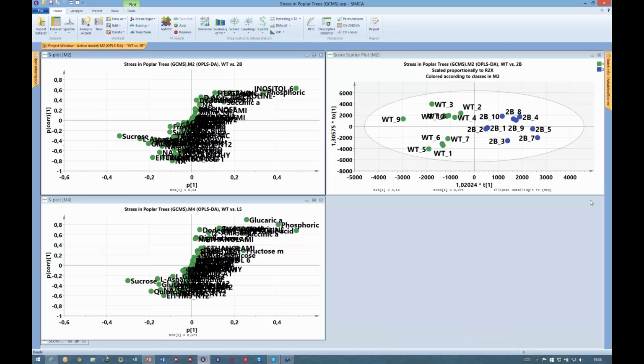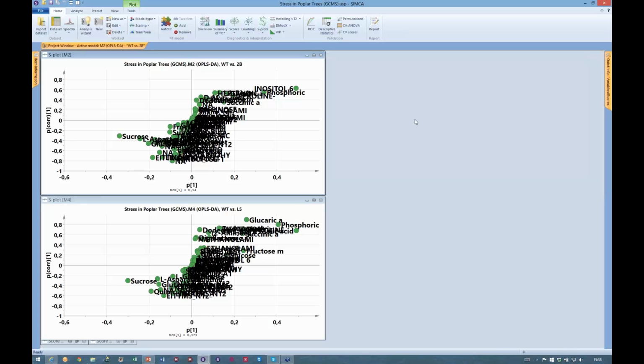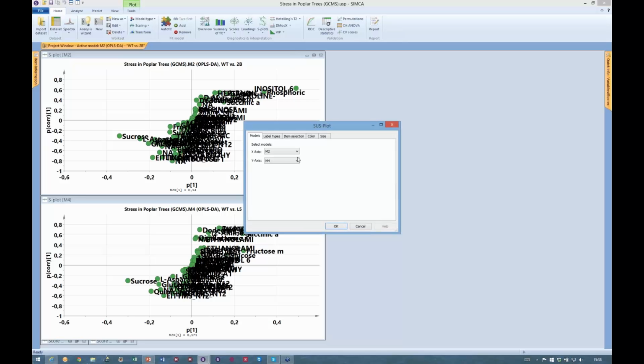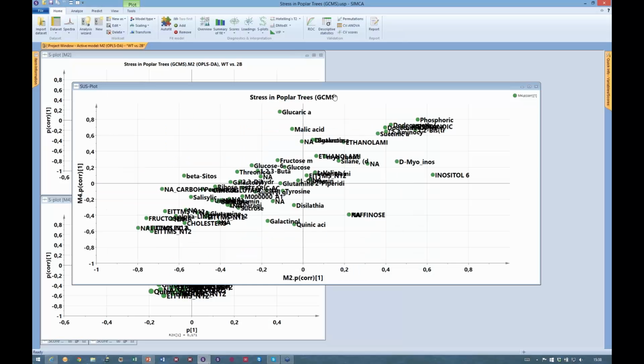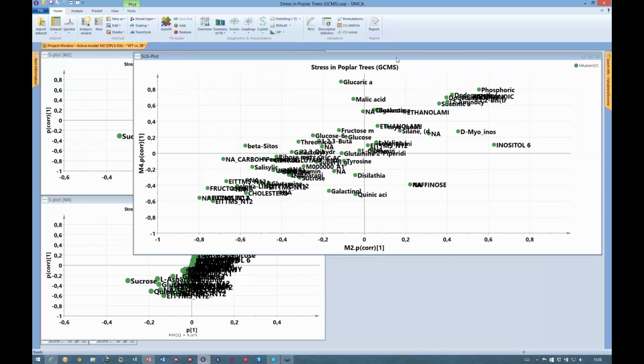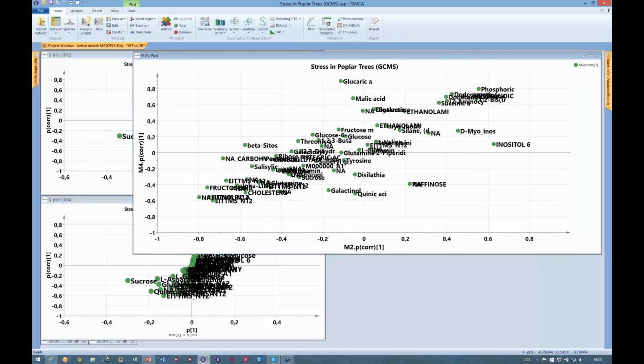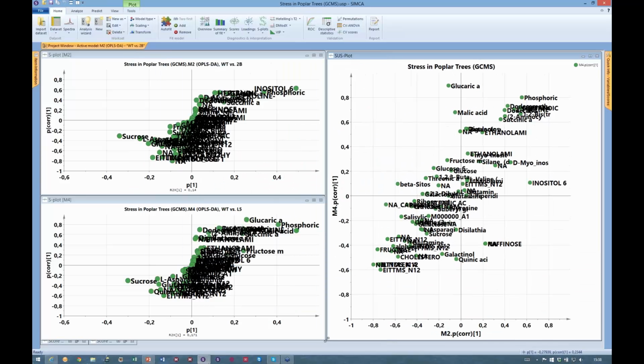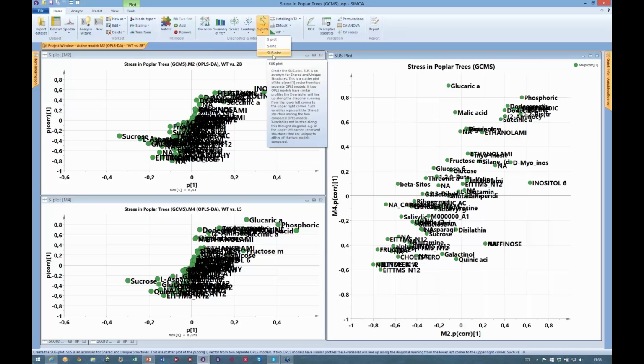I will now minimize these 2 score plots and use these 2 OPLSDA models to visualize another type of S-plot that comes inside the omics skin, and that is the so-called SUS plot. And I will do that for these 2 models, M2 and M4, and then try to arrange the SUS plot together with these 2 S-plots. By the way, SUS is shared and unique structures.